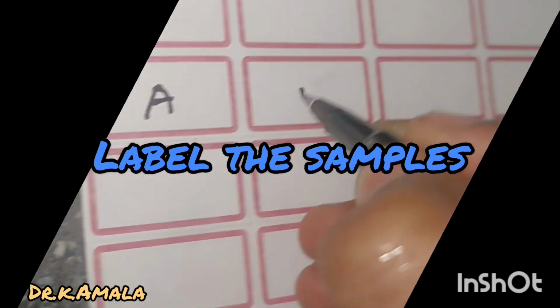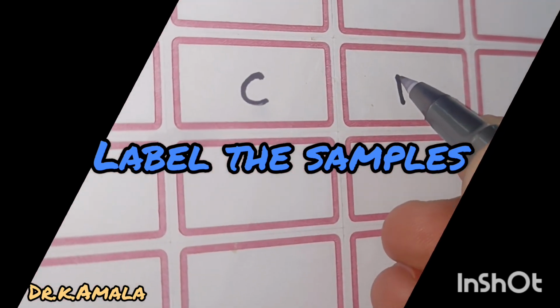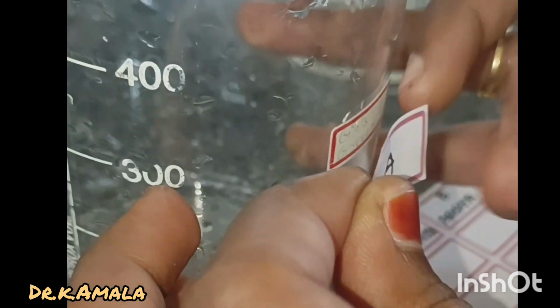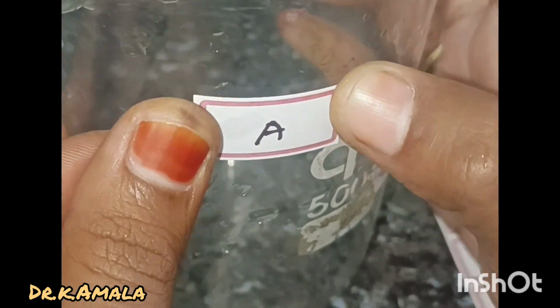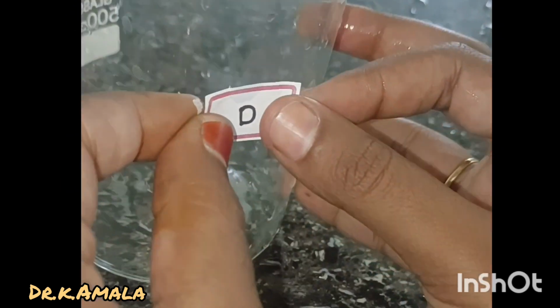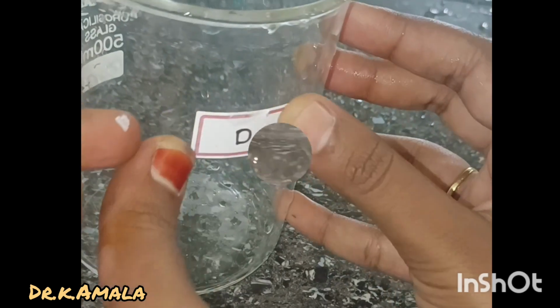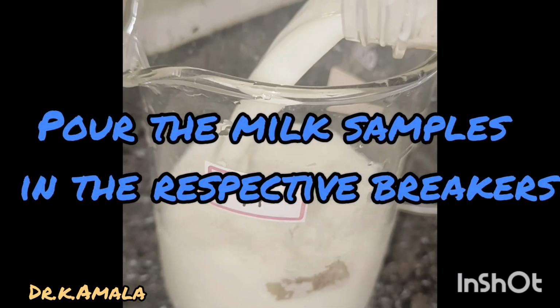Take 5 sterile glass beakers and label them as A, B, C, D and control. Collect 4 different milk samples such as pasteurized, raw milk, cultured milk and non-pasteurized milk. Pour the milk samples into the respective beakers.